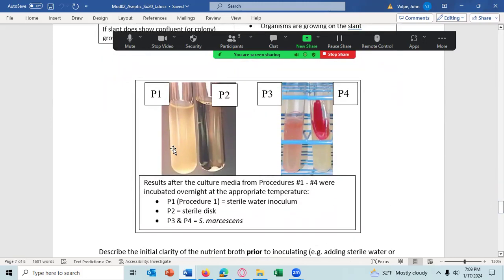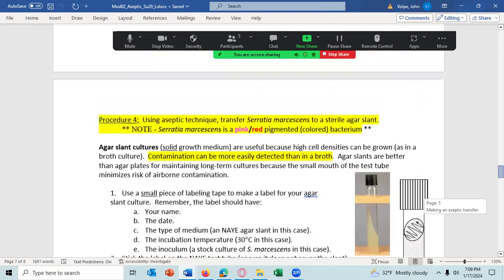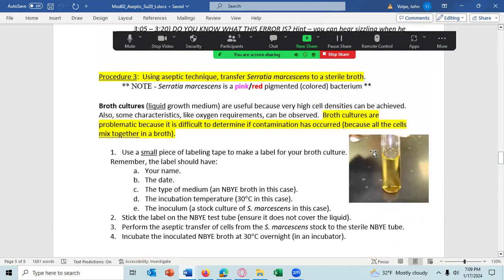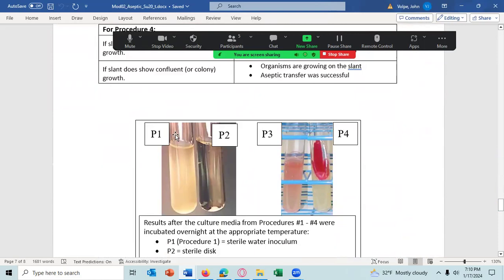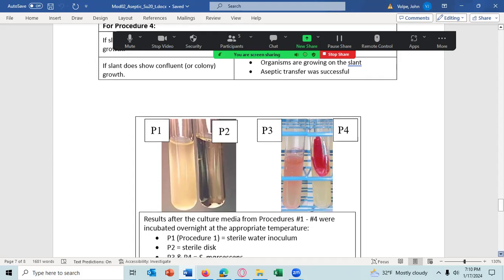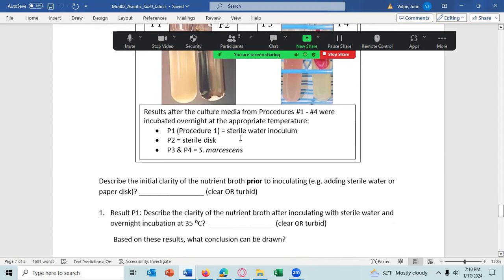You'll use these pictures for Procedures One, Two, Three, and Four. For Procedures One and Two, this is what the tube looks like at the start before you've inoculated it — in this case with a sterile one milliliter of water — and you can look and see if it's clear or turbid. Then come down to the picture for Procedure One and see whether that tube is clear or turbid. The inoculum for Procedure One was one milliliter of sterile water.